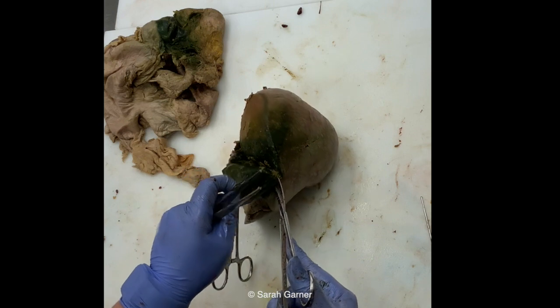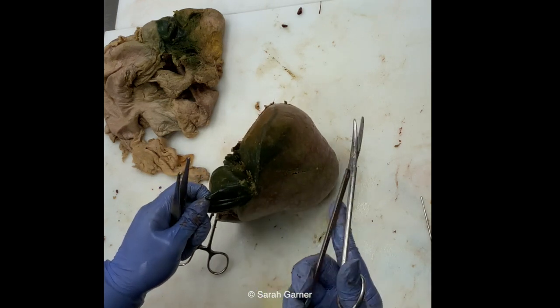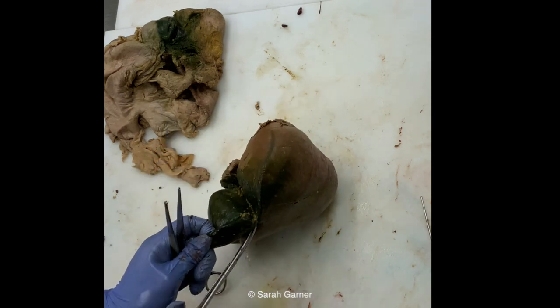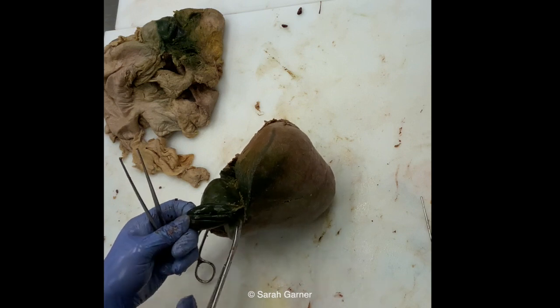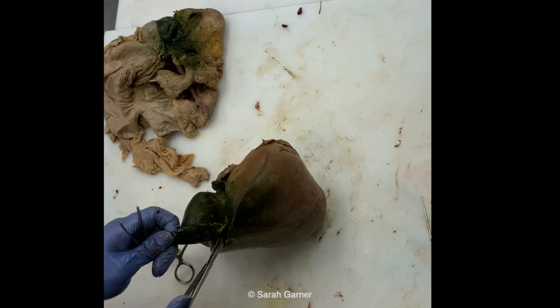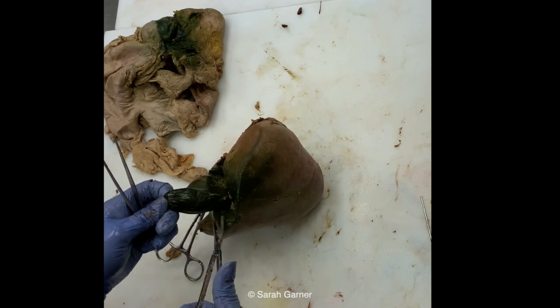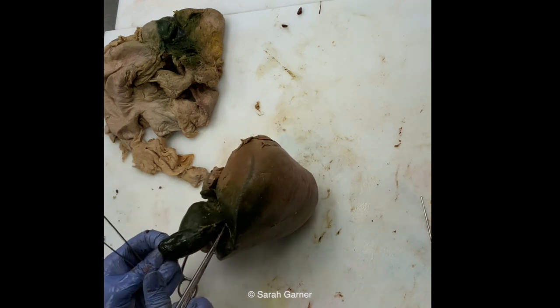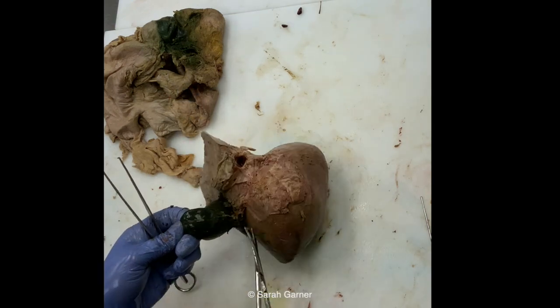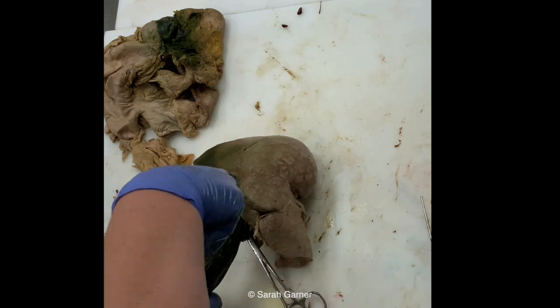Now, sometimes you can't get it off very nicely and you accidentally perf it here and bile goes everywhere. So my recommendation would be to do this over a container. You don't want to necessarily do it right over the sink because say there's something in there that you want to examine. Well, if it's already gone down the sink, you can't really examine it. So if you're holding this over a container, even if you accidentally perf it, it will all go into that container and you can still examine it. Plus, let's say there were stones in there, you don't want stones going down the drain. I'm pretty sure that is not good for your drain.